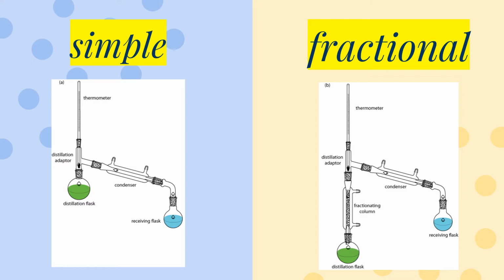On the left side, we can see the simple distillation procedure, which is a separation of a mixture primarily done through simple boiling. The volatile substance, or that with a lower boiling point, is vaporized first and removed from contact with a non-volatile substance, which remains liquid. Collecting the distillates in separate receiving flasks, these are then separated from one another. And usually, simple distillation is most efficient for mixtures in which the two components have a large difference in boiling point.